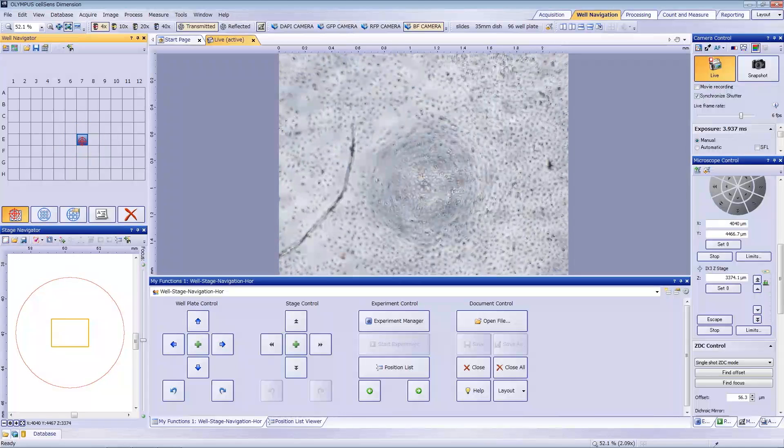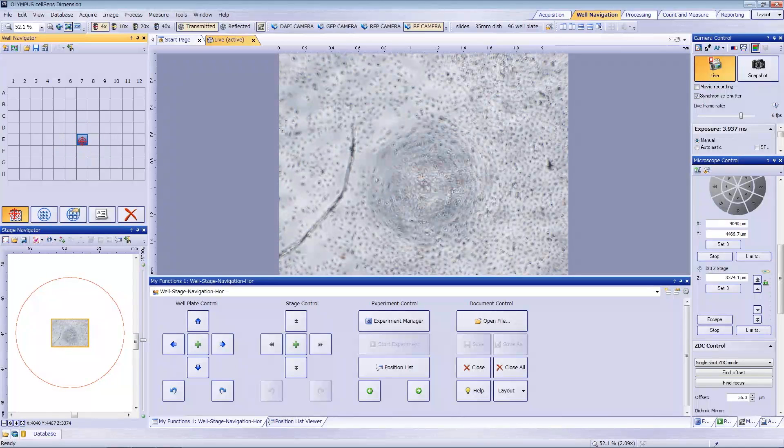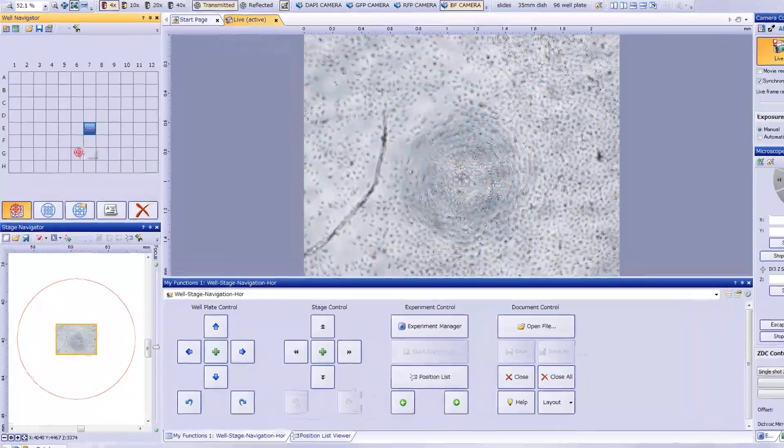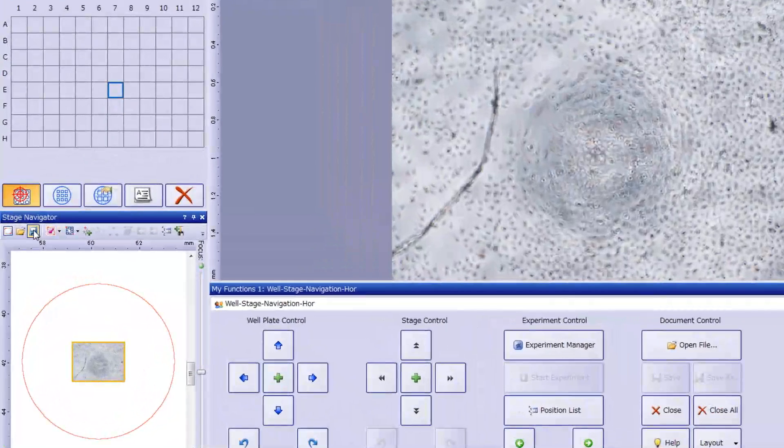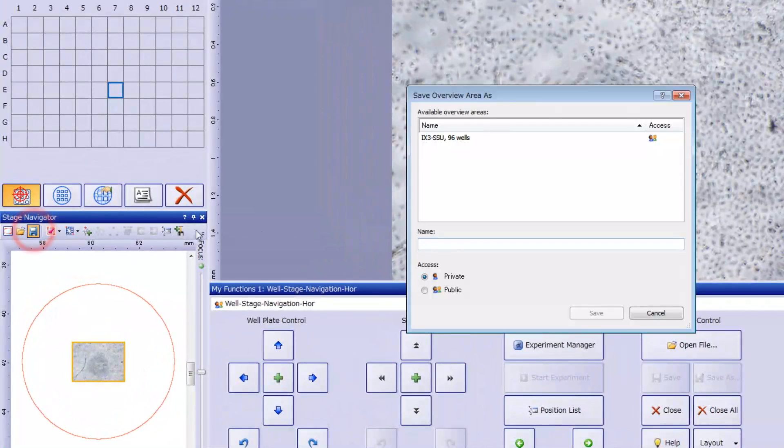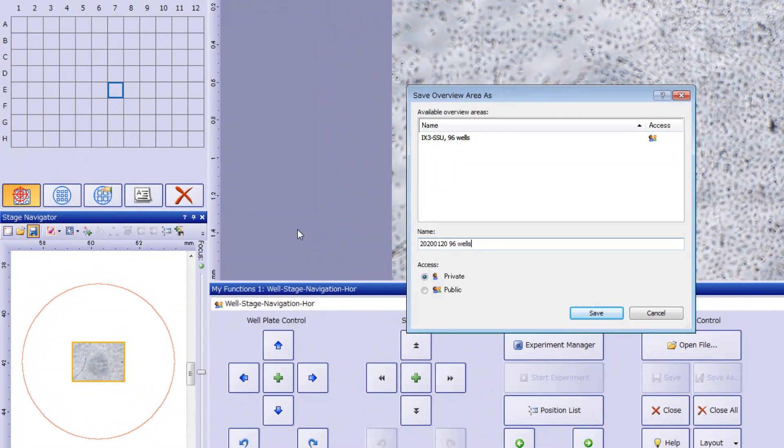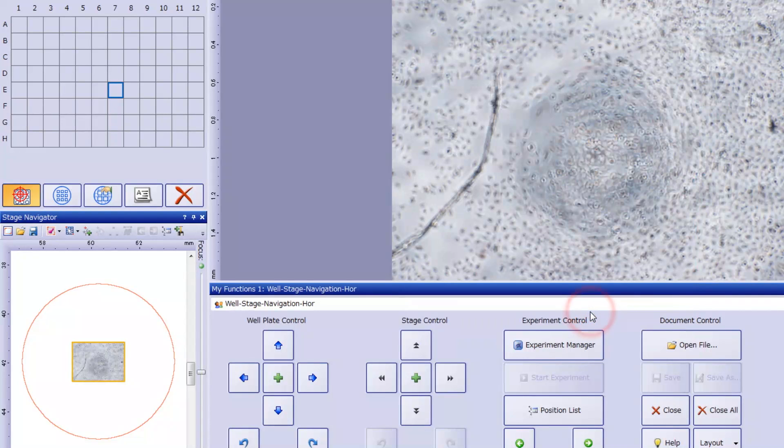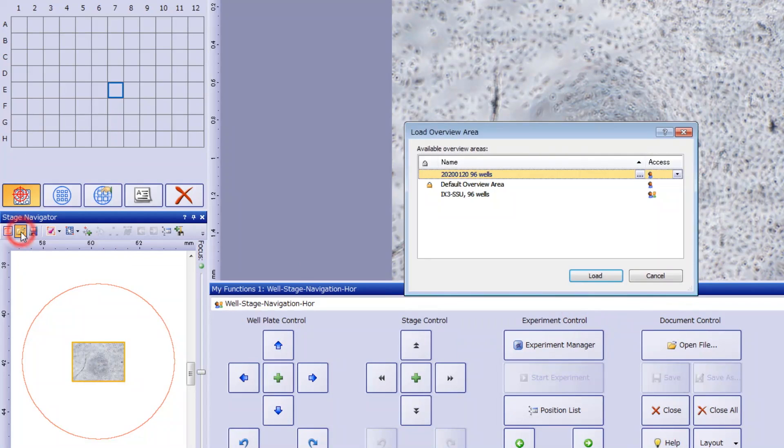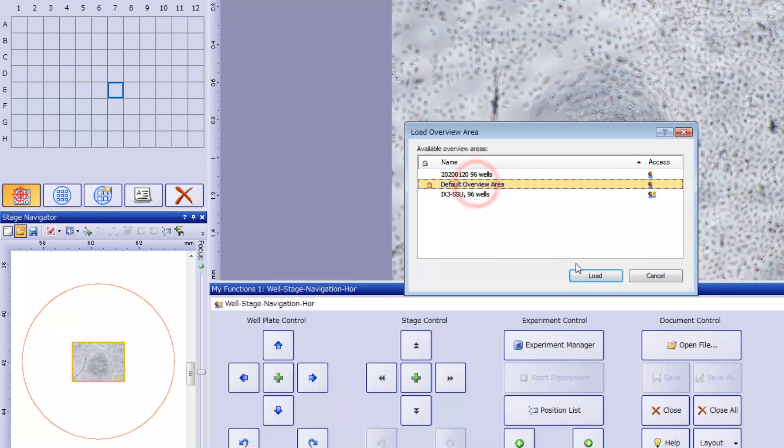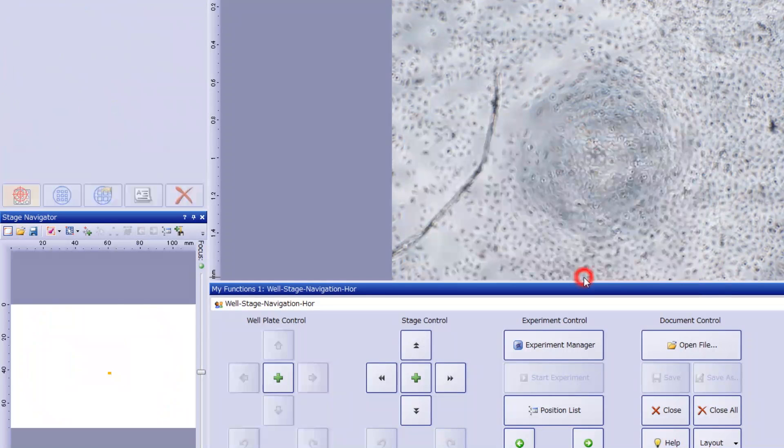For added convenience, you can save your current calibration as an overview area. You can register a variety of wellplate types and load them anytime, so you don't need to repeat the calibration process each time you use the well navigator.